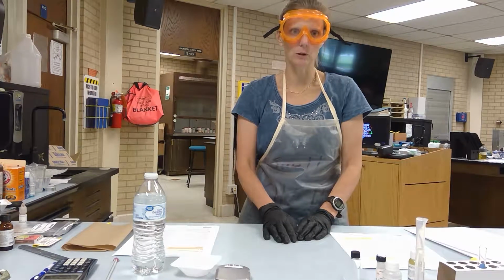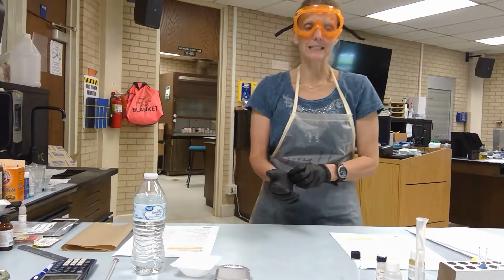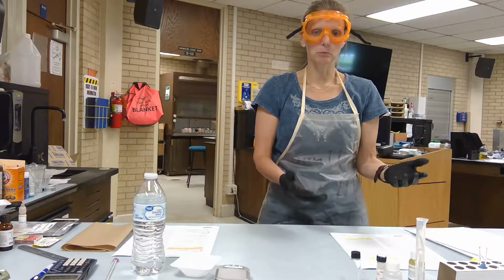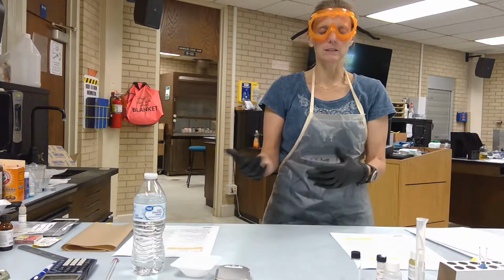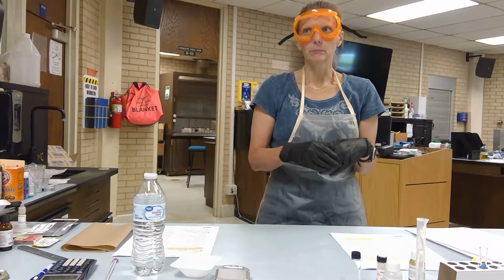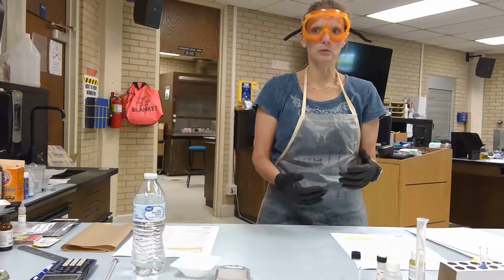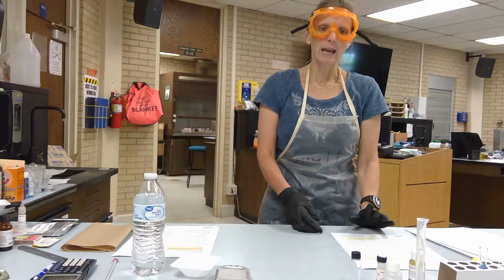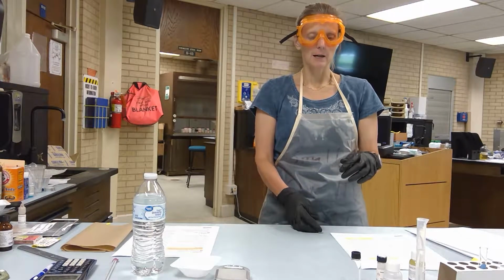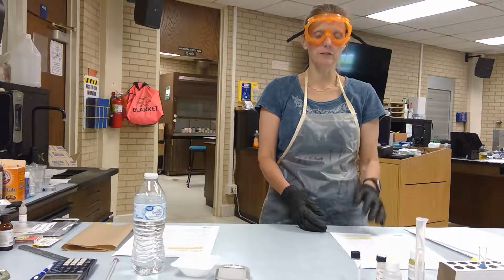One of the things that you need to be aware of, and you should have watched some videos prior to starting this lab, talks about what biodiesel is and the differences between using just generic vegetable oil and the true essence of what biodiesel is. You can go out to Burger King, McDonald's and collect the used vegetable oil or peanut oil that they're using in the fast food restaurants and recycle it, because that was the premise behind biodiesel when the process was first developed.